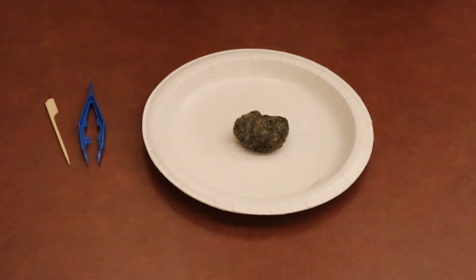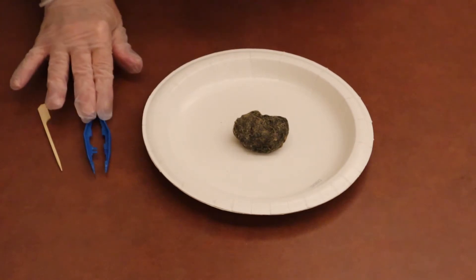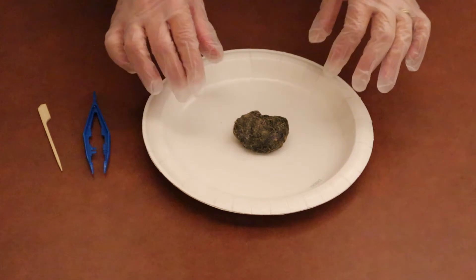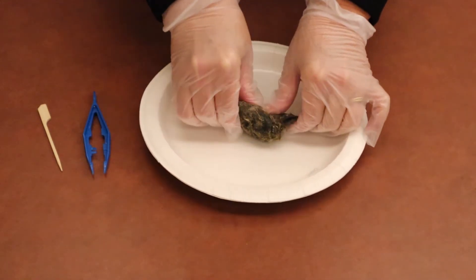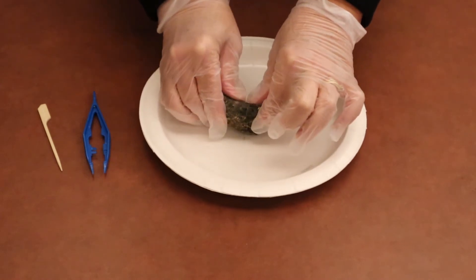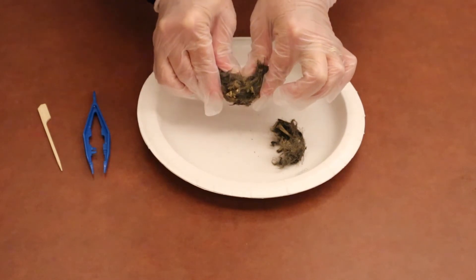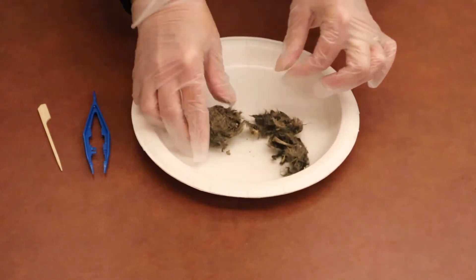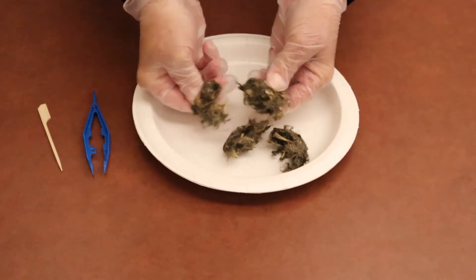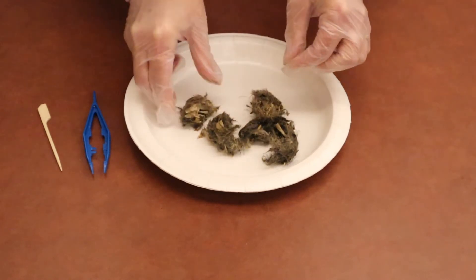Now we're going to move on to step number four. Remember that you need your wooden scalpel and your tweezers for this step. What we're going to do is break the pellet into pieces, and you might have to use some muscles. Every pellet's going to look a little different and every pellet's going to have different things in it. Remember, this is stuff that the owl couldn't digest, so we're going to learn things from this. But it's kind of stuck together.